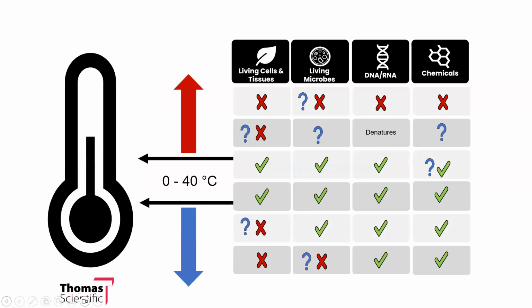Now let's look at the other, temperature and time, and they are very much interrelated. The more you grind a sample, the more it heats, and therefore the potential for heat damage. There is a Goldilocks zone, or a sweet zone, for most living organisms, most cells, most biological organisms. And those tend to be in that range of 0 to 40 degrees C. So this is like the Goldilocks zone. That's where life basically thrives and exists.